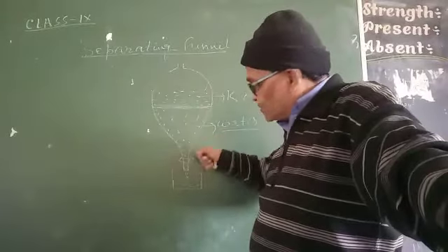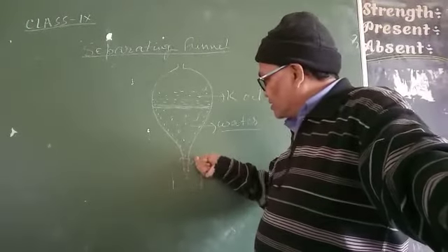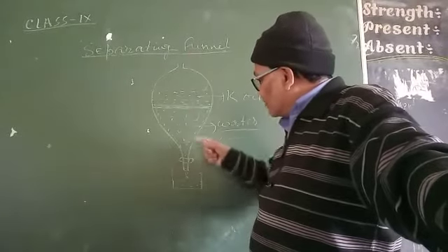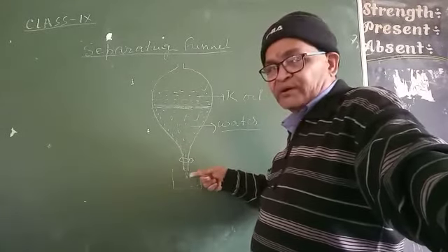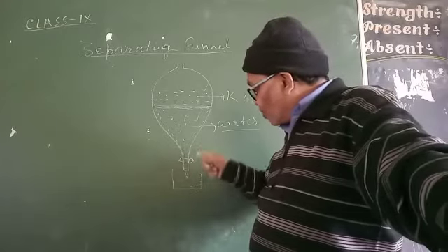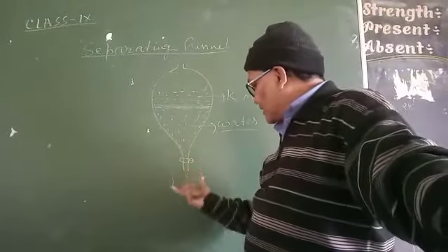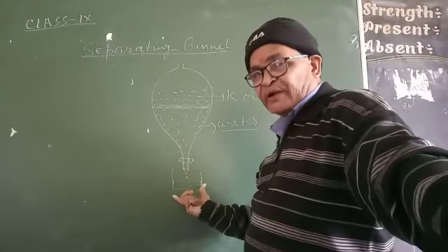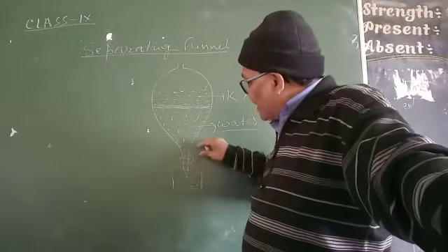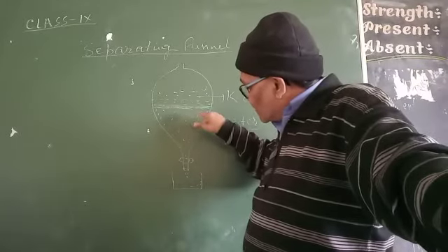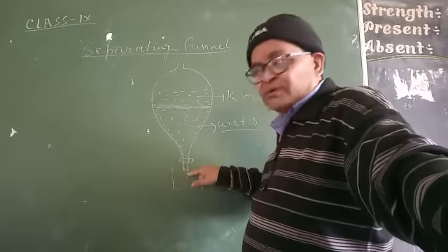When we start opening the mouth at the narrow end of the separating funnel, water starts falling drop-wise. We collect the water in a separate beaker and slowly allow the mixture to pass through.